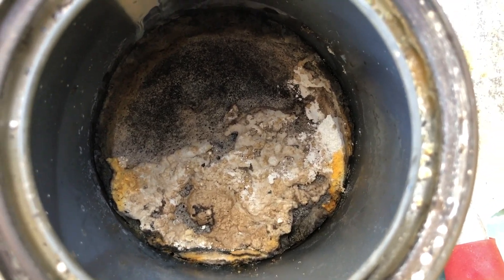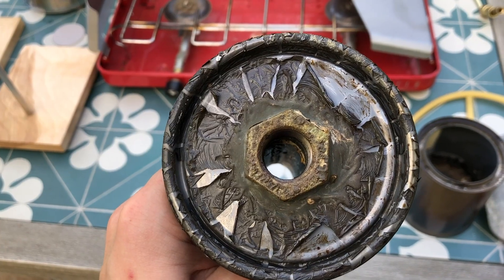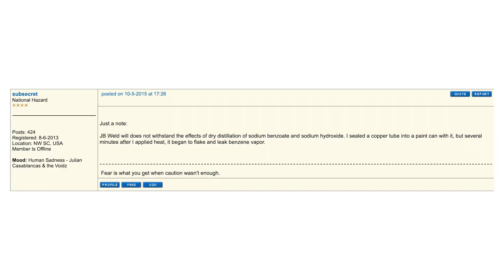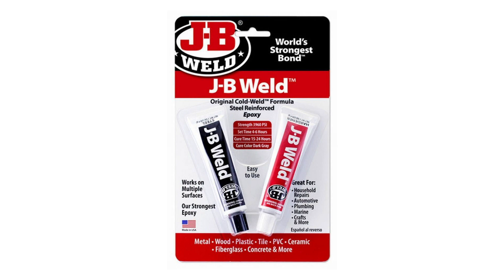These should all dissolve in water fairly easily. The top of the paint can looked disgusting, but surprisingly the JB Weld stood up perfectly. I had doubts because one user on Science Madness said that the benzene destroyed his JB Weld, but he may not have been using the steel version.